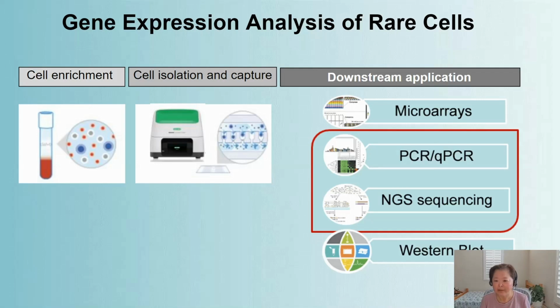NGS, on the other hand, can be used to study novel transcripts and non-coding regions. It offers a significantly better dynamic range, which is ideal for detecting low abundance transcripts. But most traditional library prep workflows are complicated and pricey, with difficulties like data analysis. With each pro and con, people tend to choose NGS for analyzing a large number of genes to narrow down the research interest, and then use qPCR as a fast, reliable, and cost-effective way to verify the NGS results.